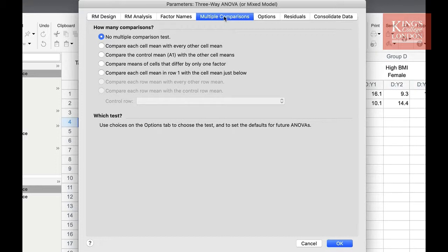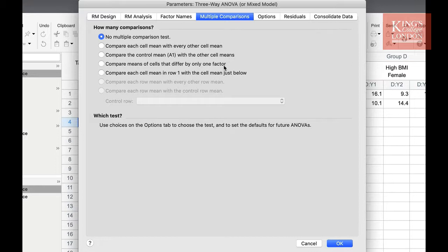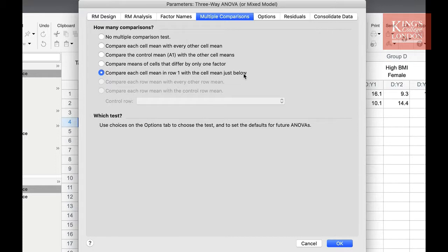The options we are presented with is no tests, each cell mean with every other cell mean, control mean with all other cell means, any cells that differ by only one factor, and the cell mean in row 1 with the cell mean just below. Since I want to see whether smoking influences the effect of VO2, I am going to choose each cell mean in row 1 with the cell mean just below.